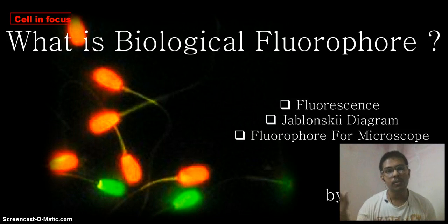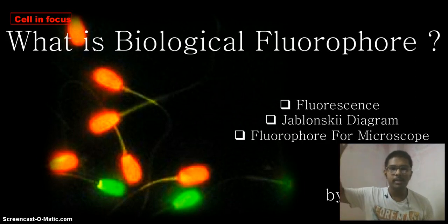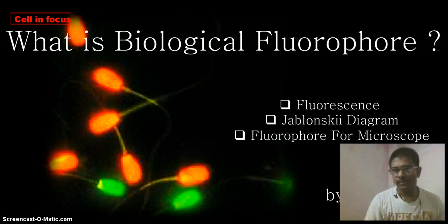Second floor also we will call excited state. Third floor also we will call excited state. So first, second, third will be called excited state 1, excited state 2, excited state 3, like this. And the ground floor is the most stable form, where people want to stay. That's why we call it a stable state, the ground state. And the first, second, third floors will be called excited states.